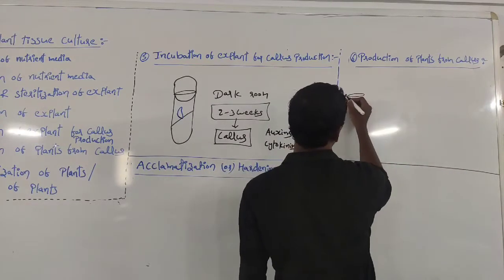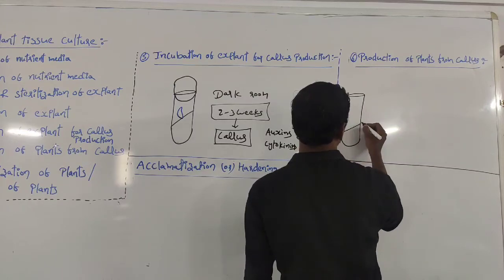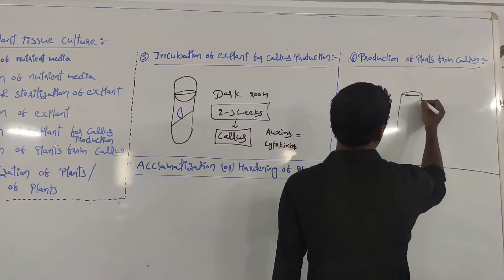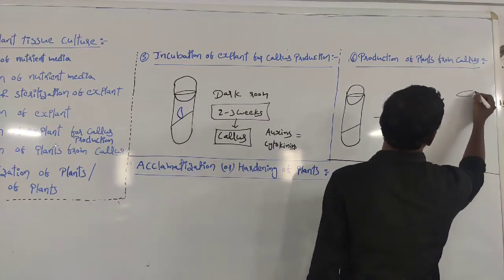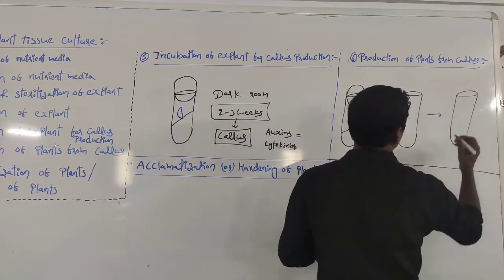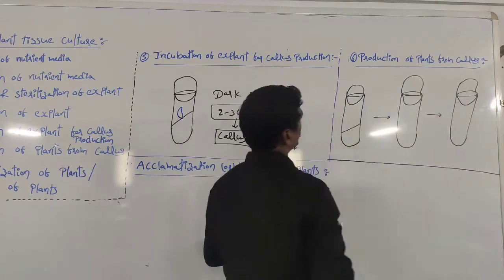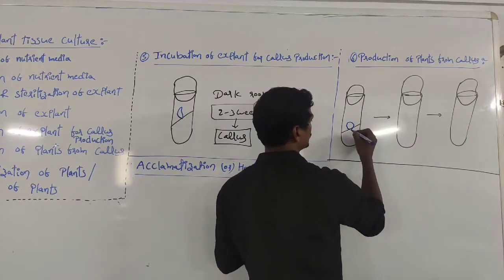So we know this is one of the tissues. Within the tissue, we already prepared the callus. This is the callus.